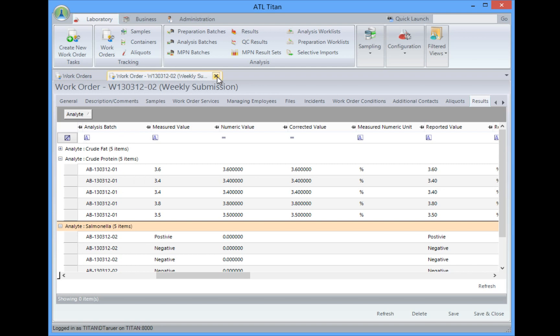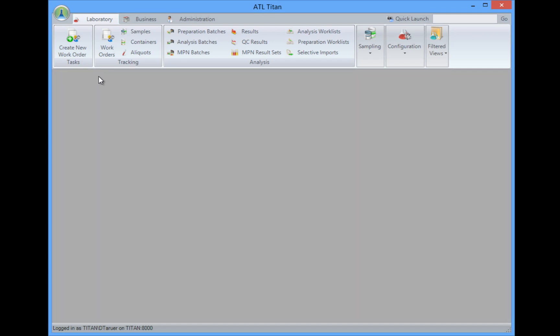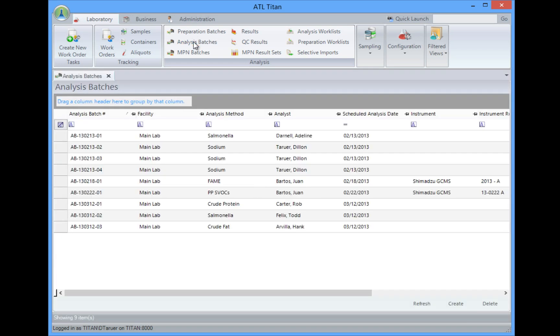So how do we get results into the system? That's another question that usually gets asked. So why don't we take a look? We can do that by creating an analysis batch. An analysis batch is going to allow us to indicate which instrument the analysis is done on, what samples were analyzed at the same time, and any quality control samples that were analyzed with this.